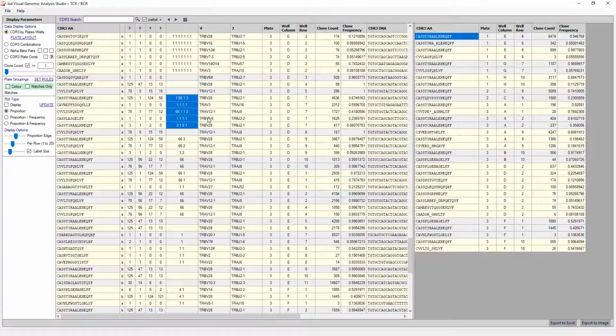The numbers are ordered from the first to the last CDR3 in the well, with the current CDR3 row missing. Therefore, the first CDR3 is seen once with the second CDR3, 66 times with the third, once with the fourth, and 3 times with the last one. The second CDR3 is seen once with the first, once with the third, once with the fourth, and once with the fifth.